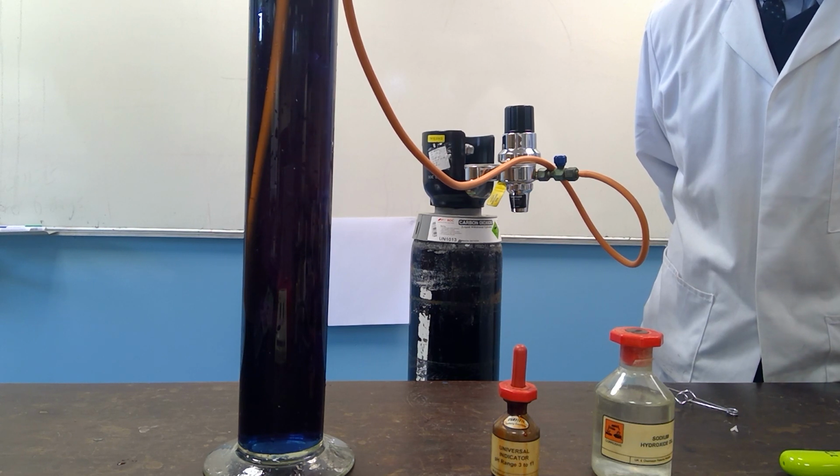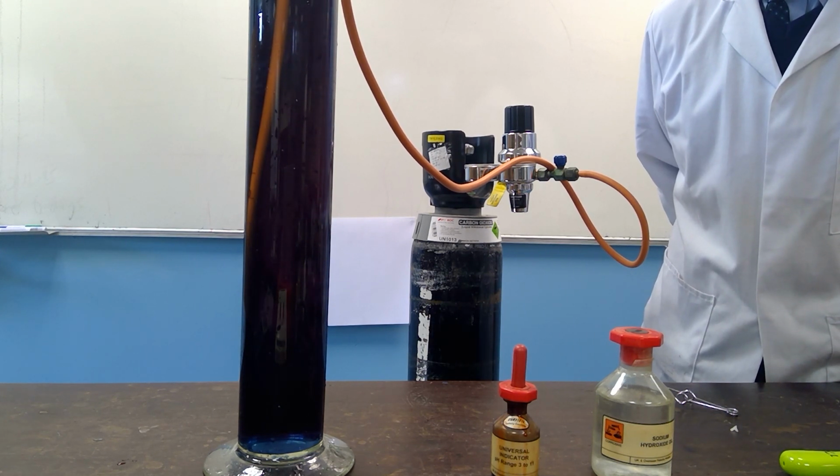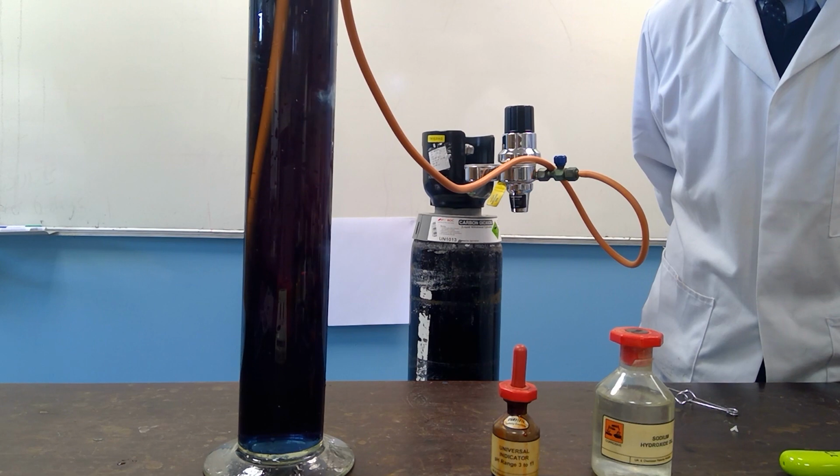Considerable quantities of carbon dioxide will be required to neutralize the sodium hydroxide, because the sodium hydroxide is a strong alkali, but the carbon dioxide, in its gaseous form of course, is dissolving in the water to form a weak acid.